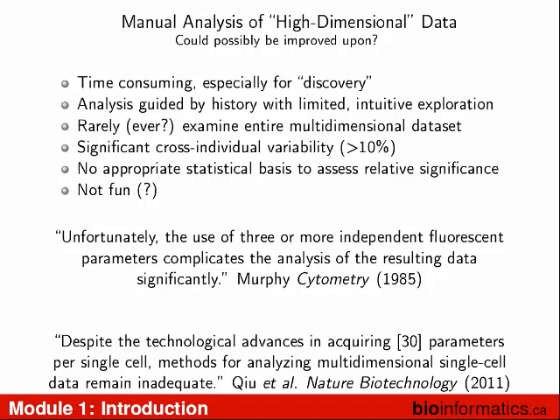There's also no really possible way to get p-values out of manual analysis because there are no real statistical underpinnings behind that. You can get p-values on your bar charts at the end, after you've done the analysis, to compare your two groups, but it's really hard to get any statistical basis for how you're drawing those gates, and we can use math to help us do that when we're doing it inside the computer.